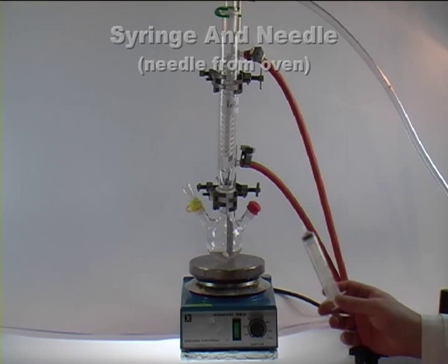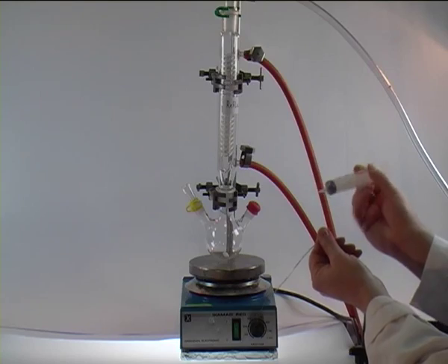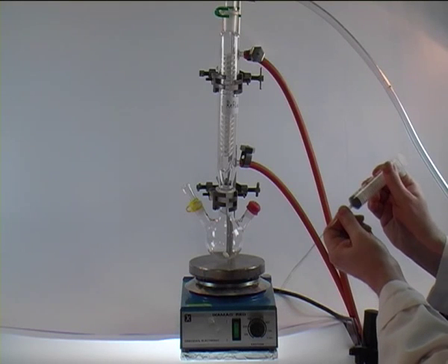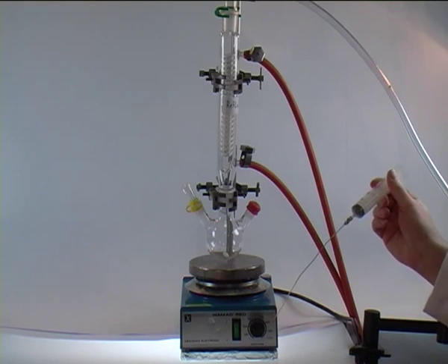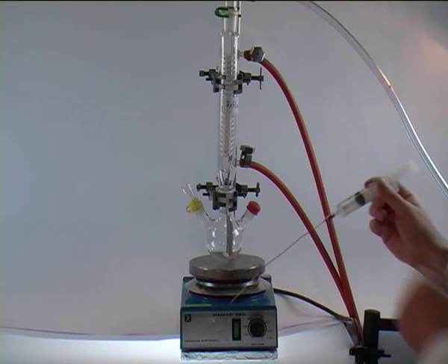Here we have our syringe and the needle, which we took out of the oven so that it is dry. In order to connect it to the syringe, we just put them together, tighten them and from the reservoir, suck in our liquid.